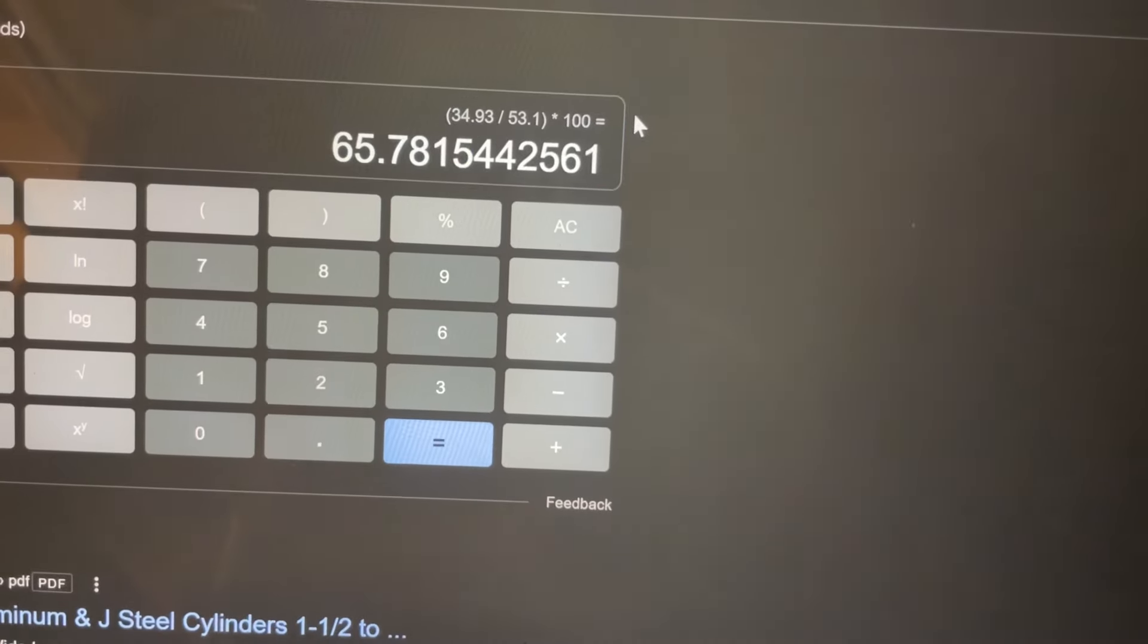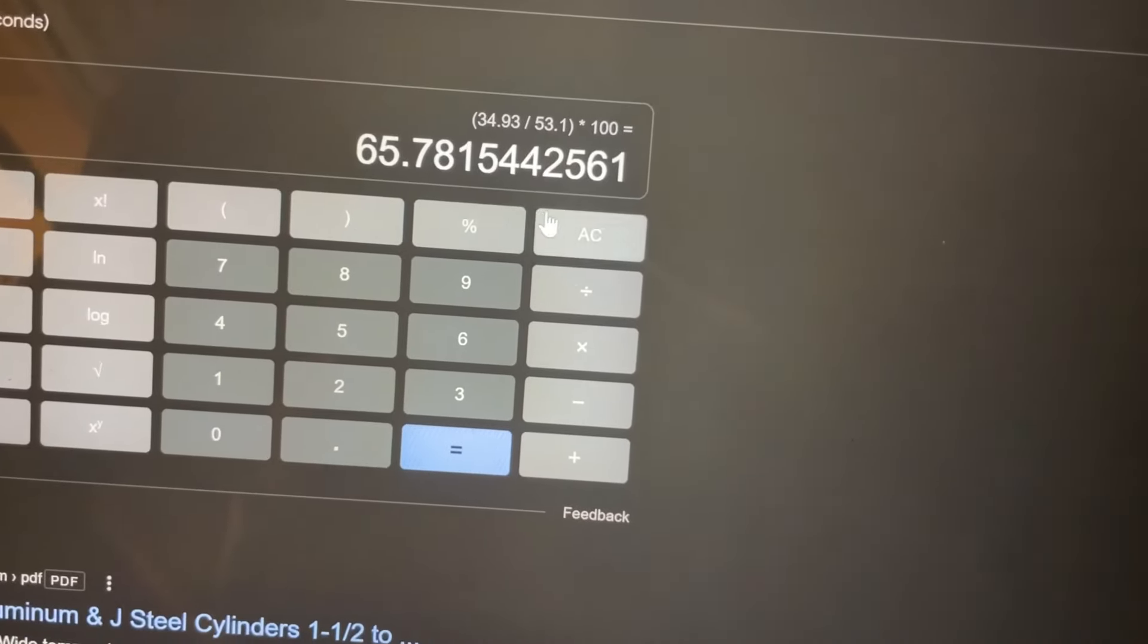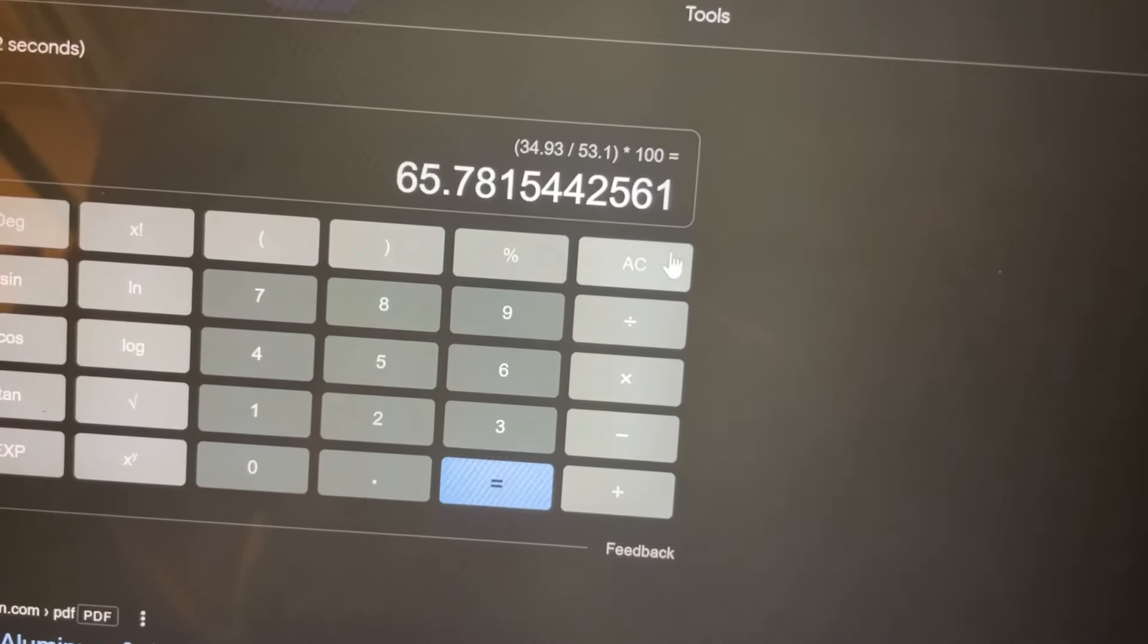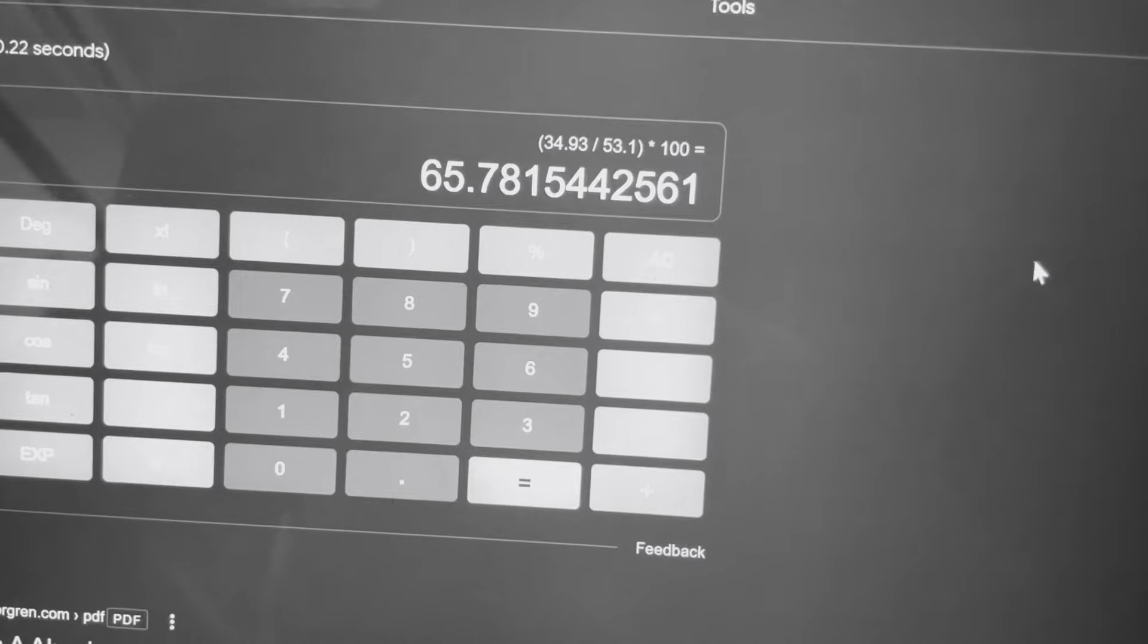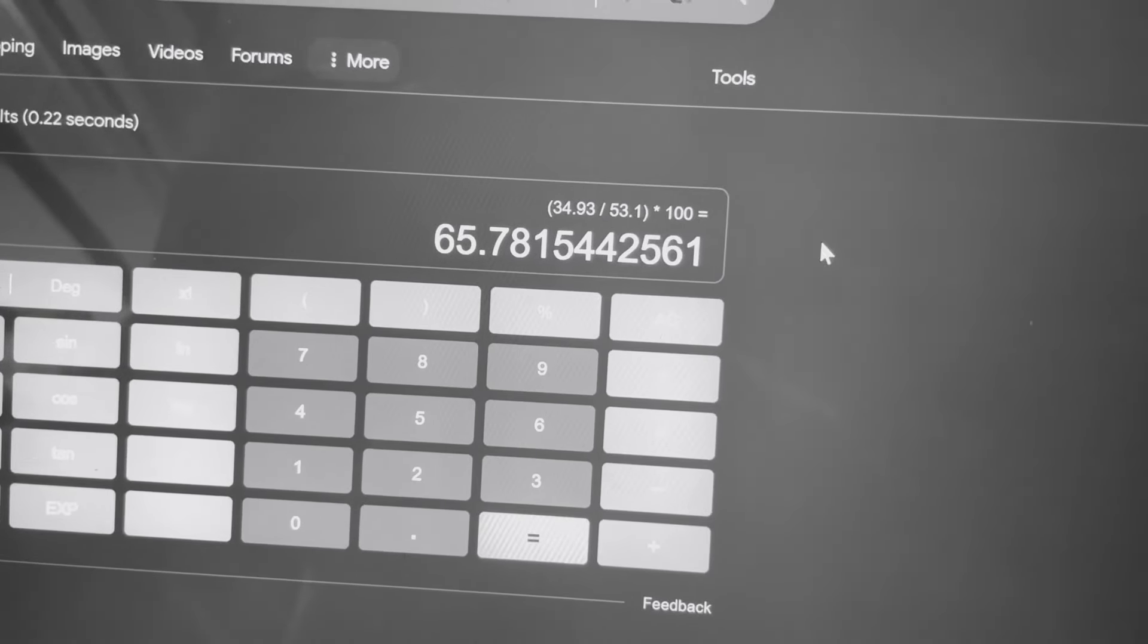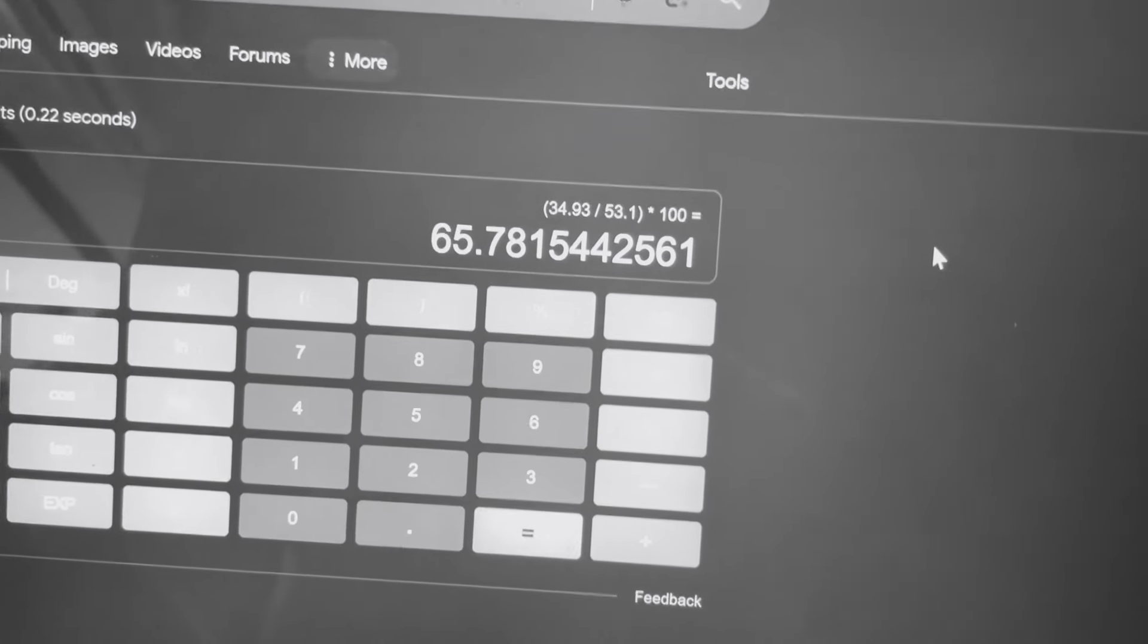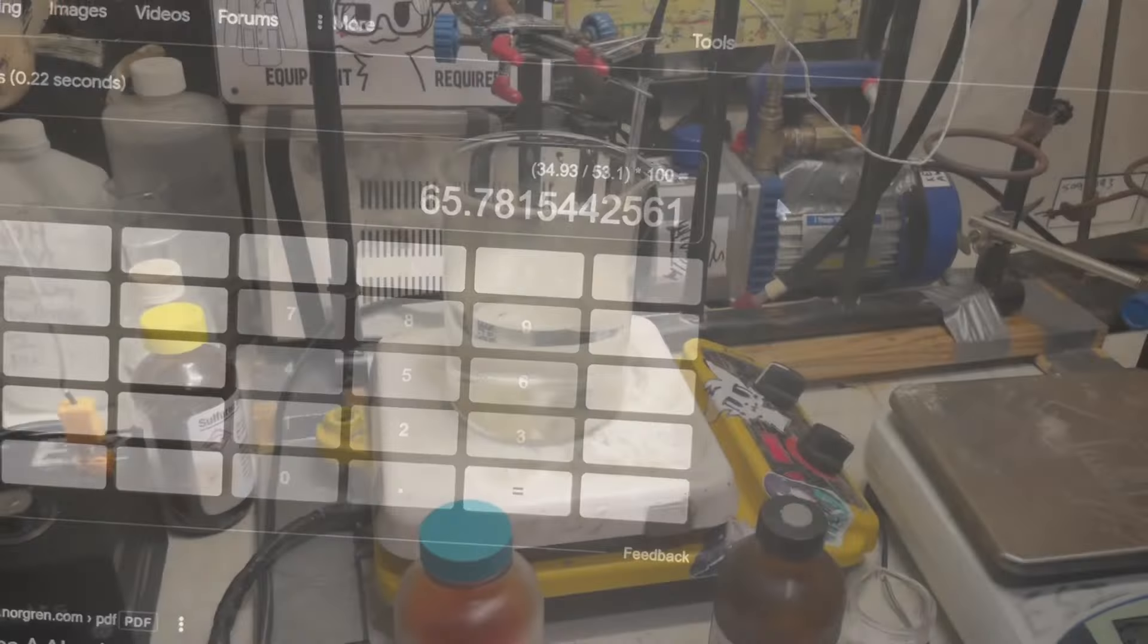Not the best, but it works. I probably could just reflux it for longer. I think that's the issue, but I have no idea. The lower yield could also be due to the ammonium boiling off, because I didn't add in the amount of sulfuric acid. And it could also be hydrazine decomposition, which is probably more likely, because I just used tap water for this reaction.